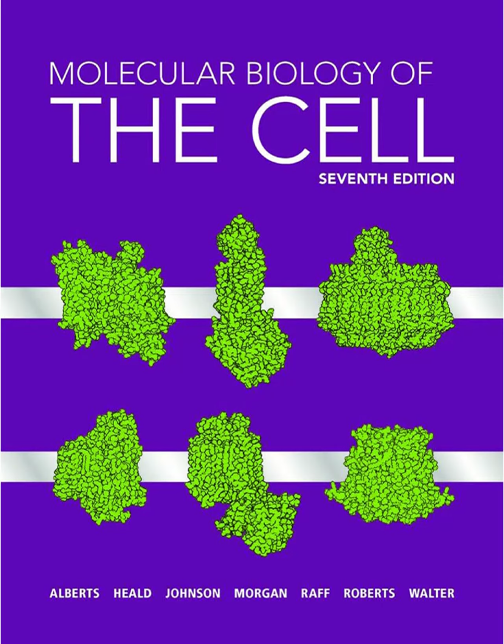This really bridges scales, which leads perfectly into the last technique, correlative light and electron microscopy, CLEM, combining the strengths of both. Exactly. Fluorescence microscopy tells you what molecules are where, functional information, specific labels, but with limited resolution and context. EM gives you fantastic high-resolution context, ultrastructure, but it's hard to identify specific unlabeled molecules. CLEM aims to combine both on the same sample. How do you do that?